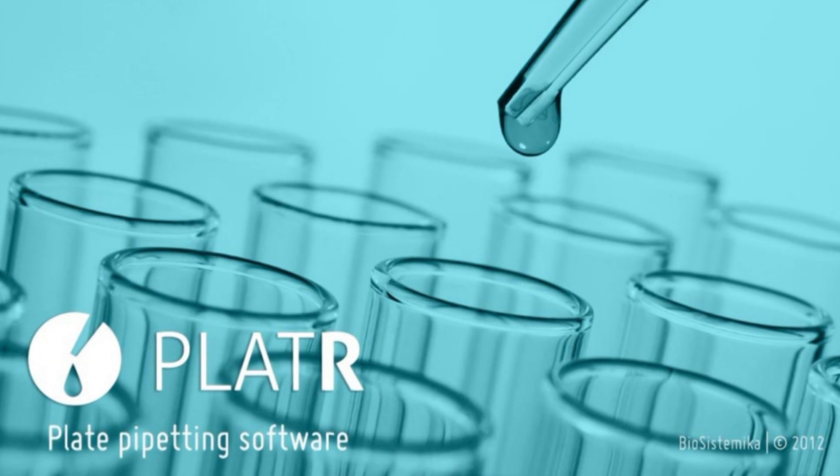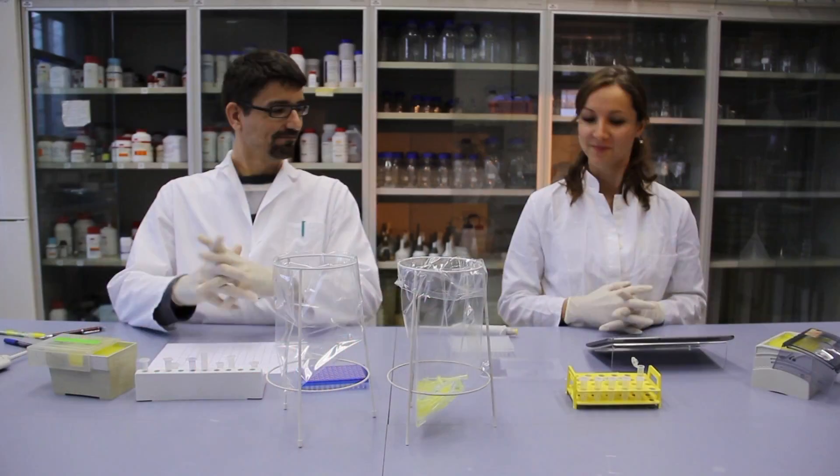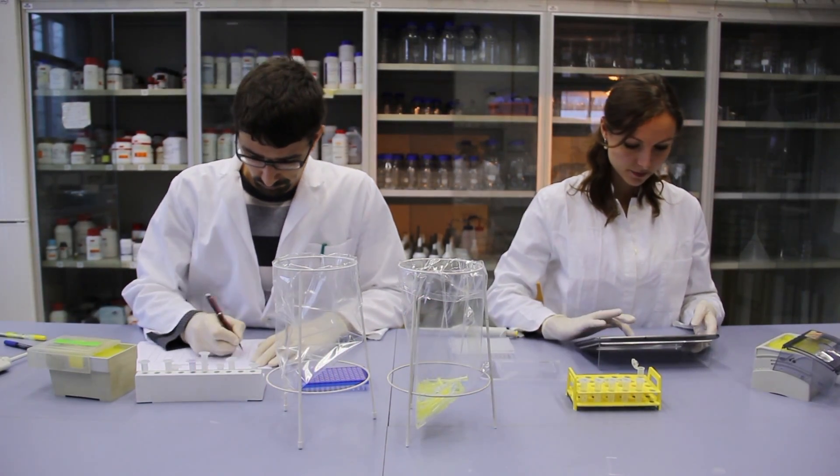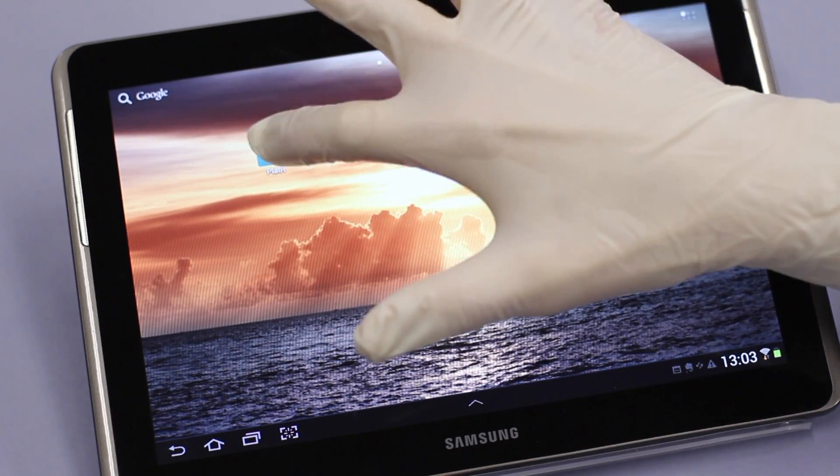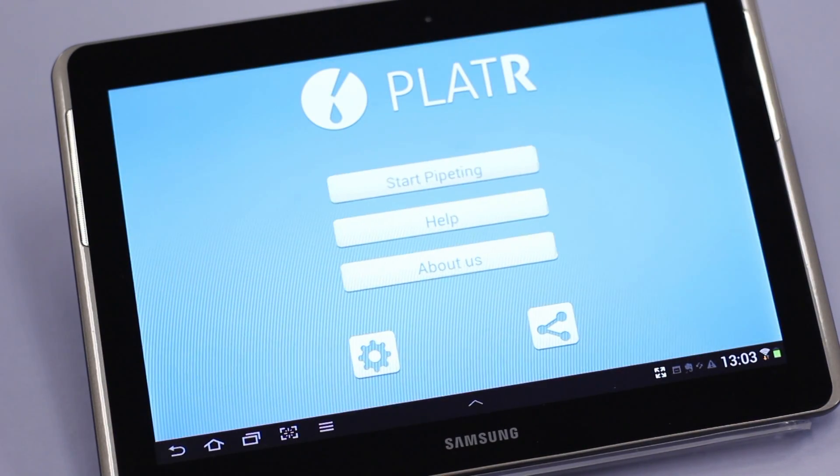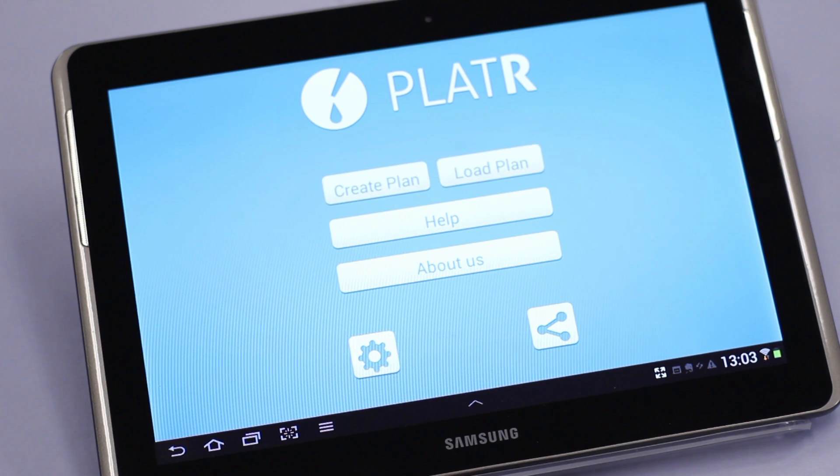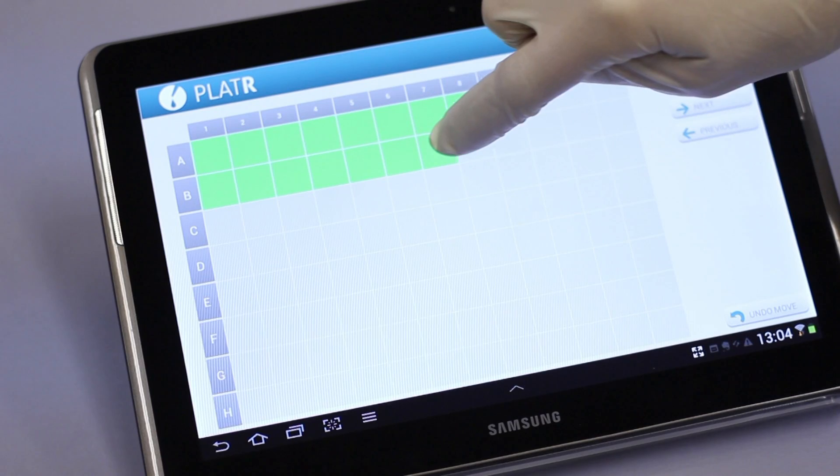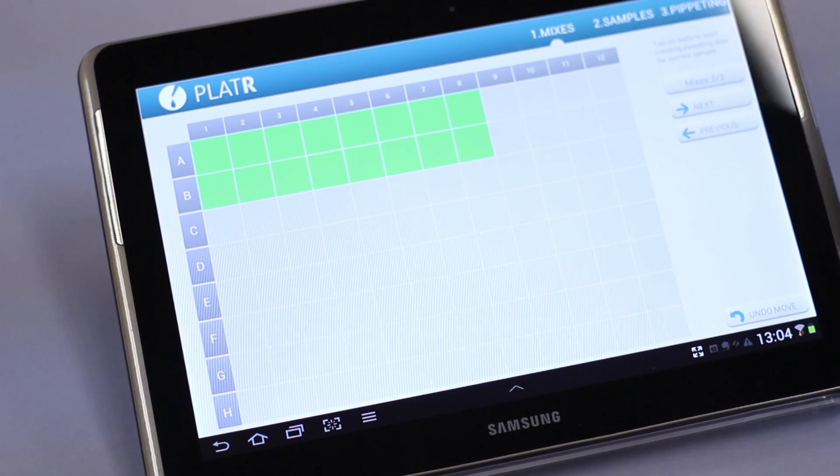Platter: Easy Pipetting. Are you someone who is still completing all of your manual pipetting the old-fashioned way? Maybe it's time to start using Platter, an innovative solution for masters of pipetting and for those of us who forget where we left off every time someone walks into the lab. Using Platter, you can create a pipetting plan.